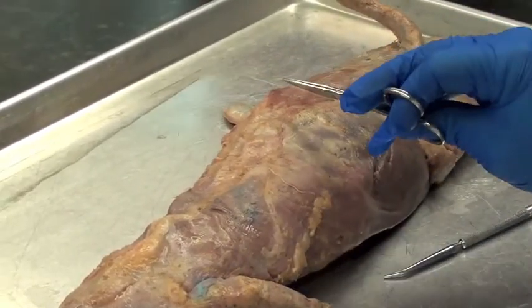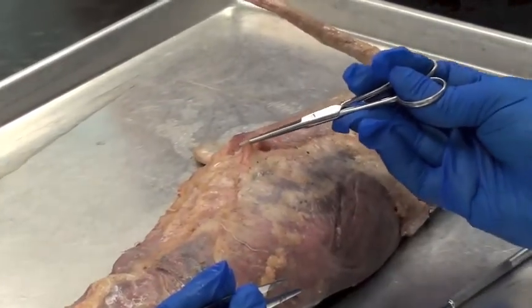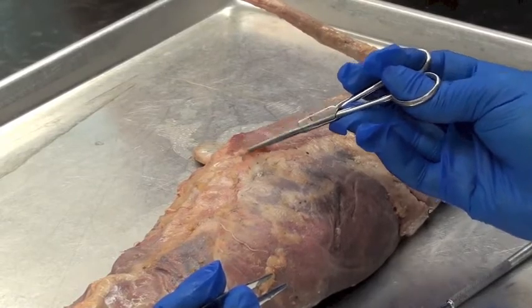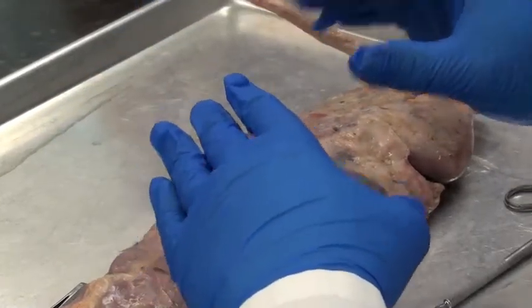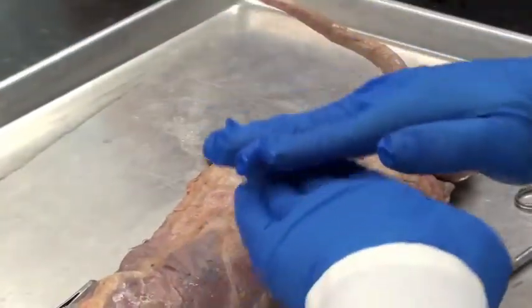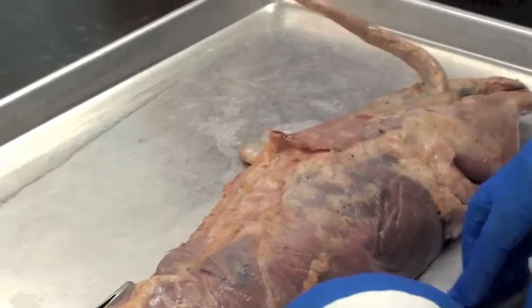We call this cutaneous maximus. This white stuff that I'm spreading open is fascia — deep fascia — which is connective tissue that separates one muscle from another. When the mink contracts this muscle, it makes the fur on its back stand up. Have you ever seen a short-haired dog when they get very angry? There's a little strip that runs right down their back where the fur stands right up — that's very similar to what this muscle does on the mink.